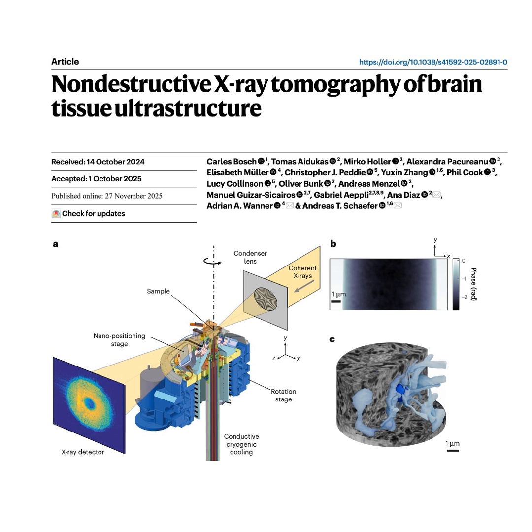Exactly. The ultimate success here is that TGPAP endurance. The fact that the tissue ultrastructure was preserved even after doses exceeding 10 to the 10th gray, that's the cornerstone. It cements the claim that the radiation damage barrier is, for all intents and purposes, removed. And removing that barrier is what changes the whole landscape of connectomics. It does. Because PXCT is non-destructive, the technique is scalable to much larger volumes without that physical stitching headache from EM. The researchers believe this dose resistance is theoretically sufficient for whole mouse brain imaging at sub-20 nanometer resolution.